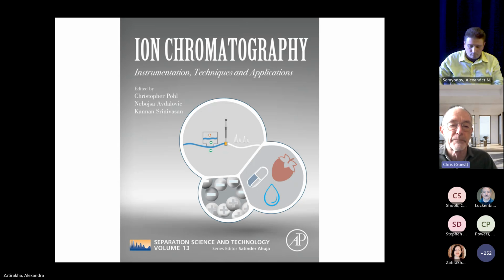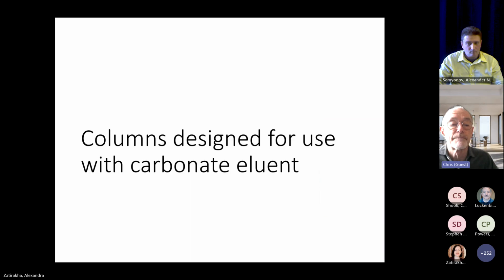Anyway, if you're interested in more details, every one of the slides I show today also has a section associated with it that has more details than I'm going to be able to go into today, because it's about a 90-page chapter or something like that. And it goes into other phases like ion exclusion phases and things like that I'm not going to discuss today. So how about go to the next slide, please?